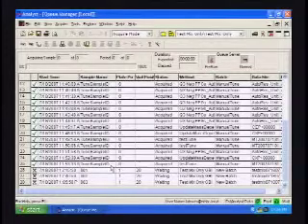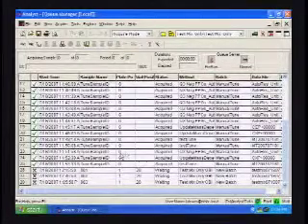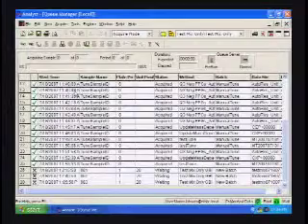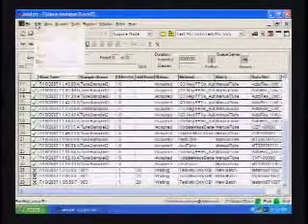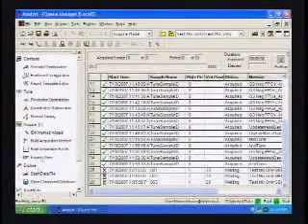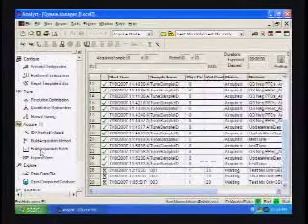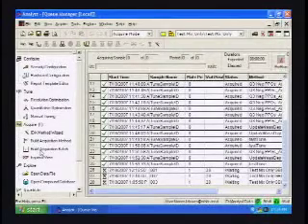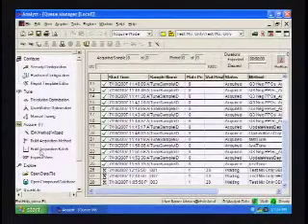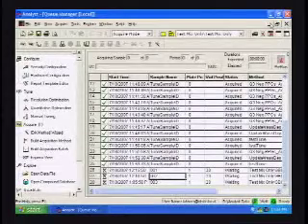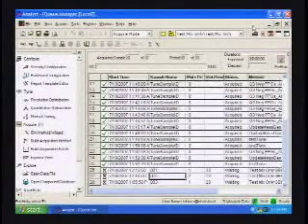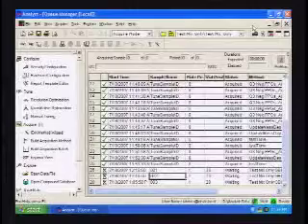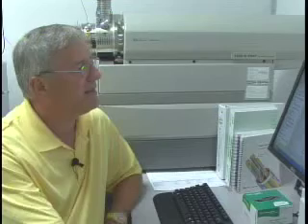So this is how you set up an acquisition. At any point, you can go back to the navigation bar, go back to build acquisition batch, set up another one, submit it to the queue as well, and it would append to the end of the table. Also, if you wish to, you can delete examples from the queue as well. So this sample will run then, this test mixture sample will run, and it will enable us to determine if the LC and GC mass spec have met the acceptance criteria that we set.